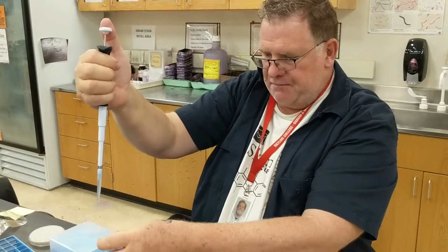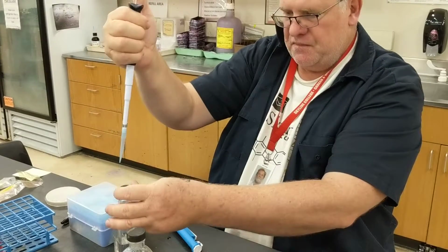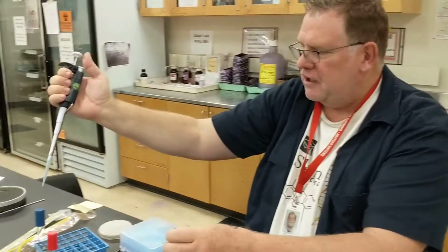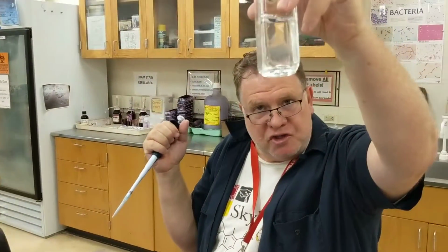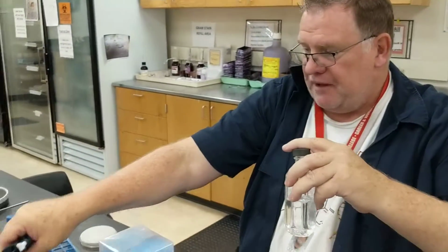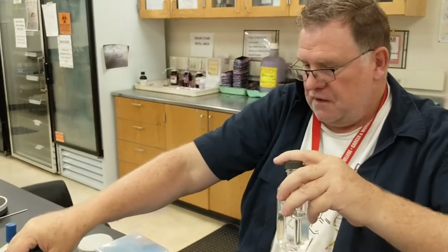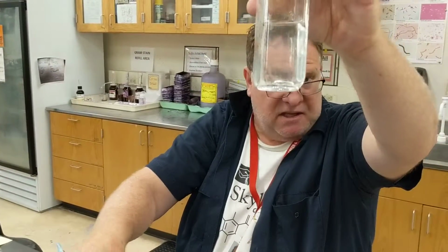I would then put it into the next tube. Then you're done, and you would dispose of this in the right way. Again, this is a 1 to 10,000 dilution, and as you can see, it goes from being colored to a light red color to being basically clear, because we've diluted so many times.